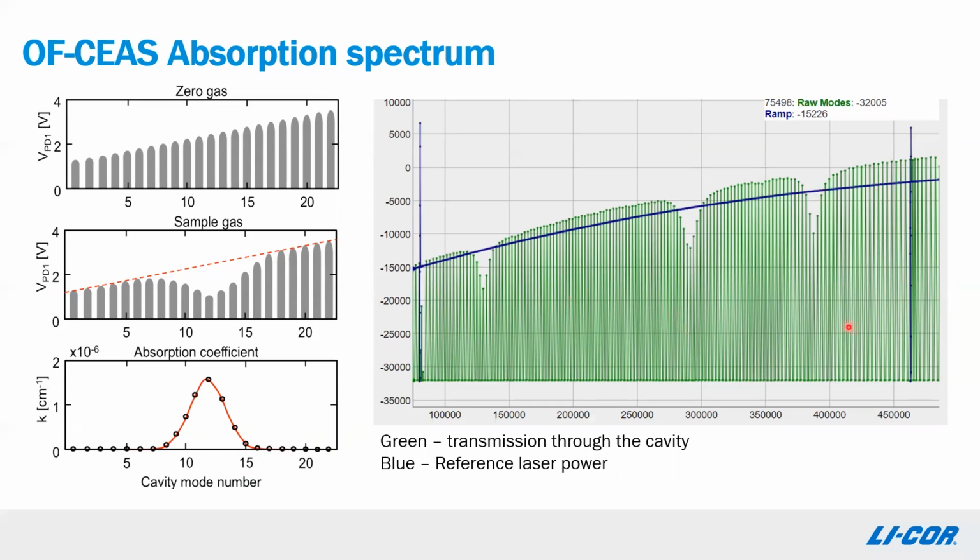We're taking many, many spectra per second, processing those to deliver that true 1 Hertz measurements of one measurement every second.